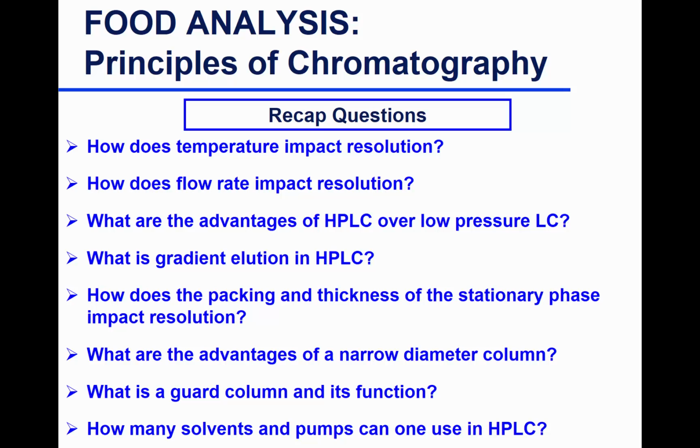For example, in reverse phase chromatography, you might have very strongly hydrophobic components that interact with your functional groups and not want to leave. No matter how much you increase your acetonitrile, they will just stay there and block your functional groups on the column, and therefore you lose capacity of the column. And when you lose capacity, your retention time becomes shorter, and therefore you will have peaks coming closer to each other and you lose resolution.